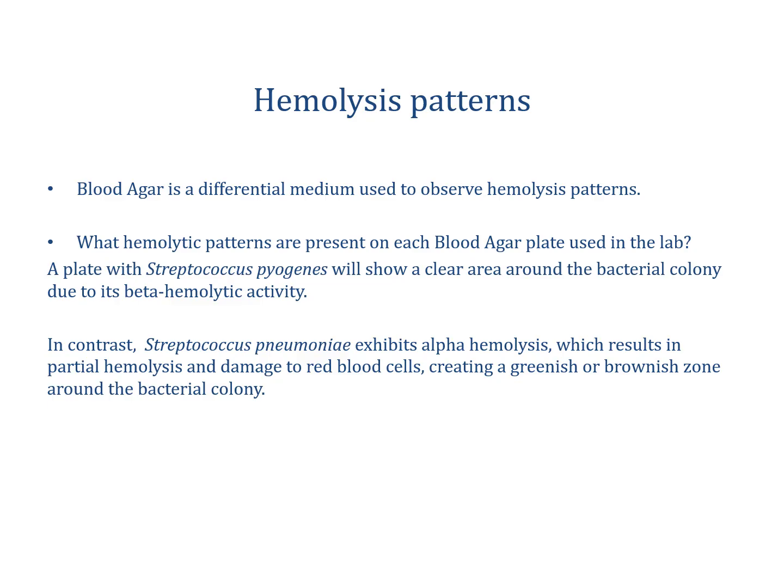So for differentiation between Staphylococcus and Streptococcus, you want to be able to distinguish between their gram stain. They're both gram positive, so they appear purple after gram staining them. The difference between them would be that they're both coccus shaped, so they're both round, but when you're looking at them under the microscope, Staphylococcus would appear in clusters and Streptococcus would appear in chains. What rapid test can be used to differentiate between Staphylococcus and Streptococcus? That would be the catalase test, because Streptococcus is catalase negative.